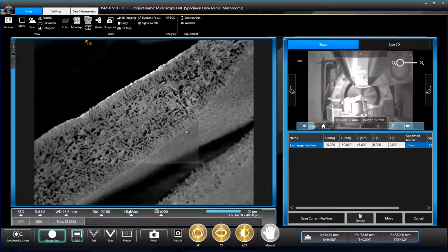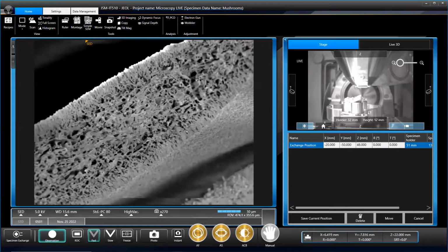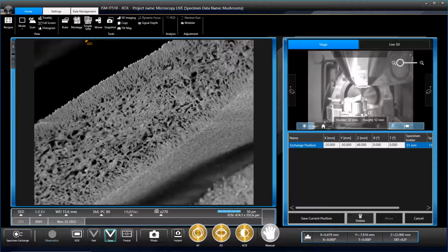No, it's actually a bit better. That central bit seems much broader than the shiitake mushroom did. Like the bits that grow spores seem much shorter. Yeah. The gills are a little bit wider as well. Oh, that looks neat on the top. That's nice. Yeah. That's a very dense layer, isn't it, of spore producing structures.